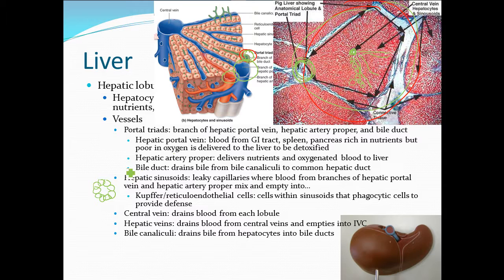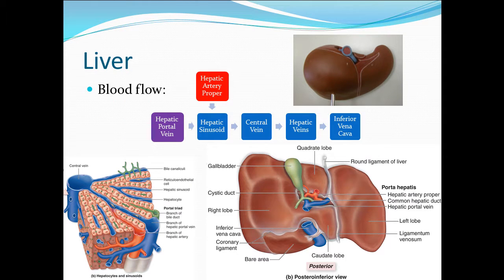So this is a bile duct here. And they're pretty obvious when you look at it in comparison. So even here, this structure that I see over here, I could tell that's the bile duct right there. Of course you have to zoom in a little closer to see the details, but take a look at it under the microscope.